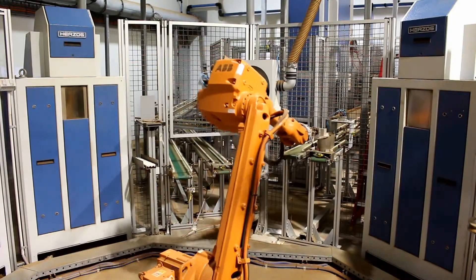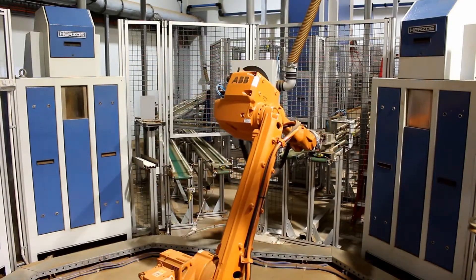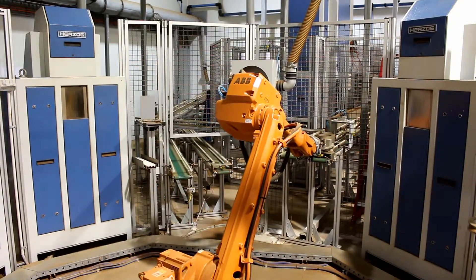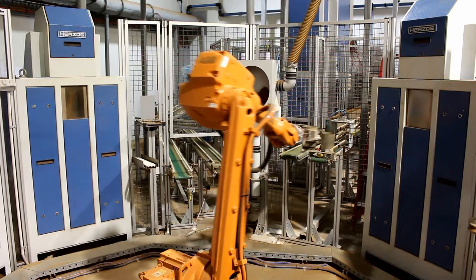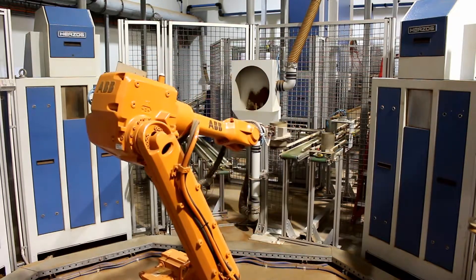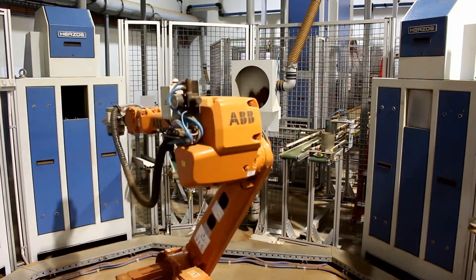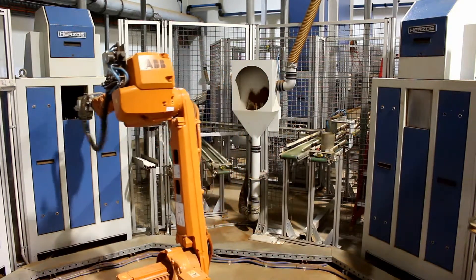Laboratories such as this are able to prepare and analyze over 800 samples a day and can be comfortably operated by three to five personnel in a 24-hour period.